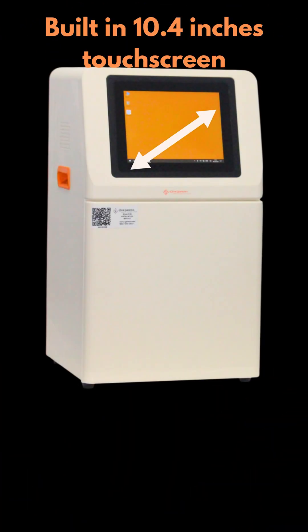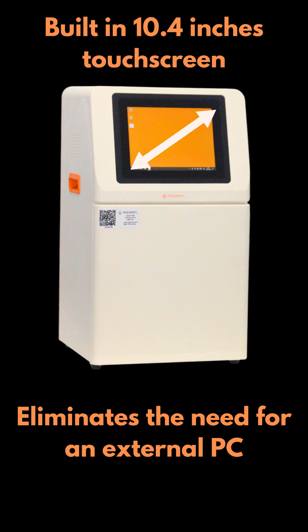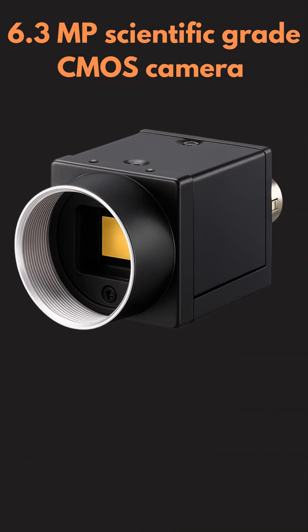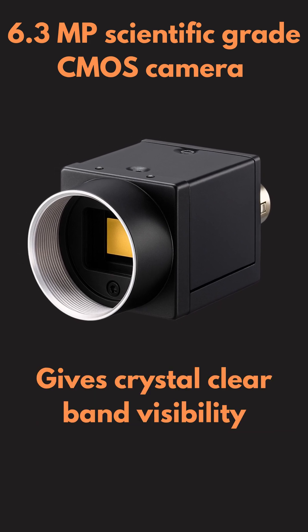Built-in 10.4 inch touchscreen, which eliminates the need of an external PC — just touch and go. A 6.3 megapixel scientific-grade CMOS camera for crystal-clear band visibility.